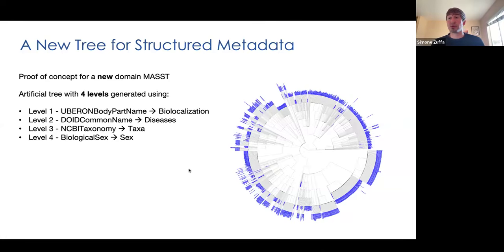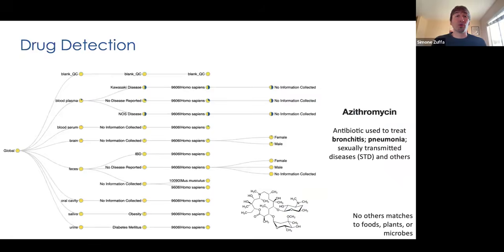Now you will be able to see if this specific MS/MS spectrum was also observed in other Alzheimer's patients, and for example, if they were male or female, and where they were actually localized, maybe just in the blood or just in the brain. Obviously we haven't solved the Alzheimer's problem. So I'll show you a quick, easy example of how this tool will work.